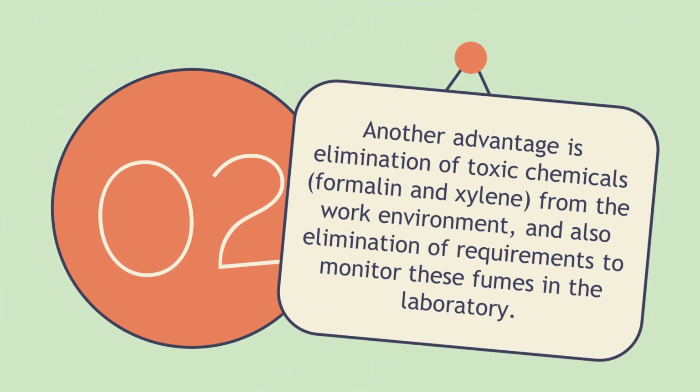Number two, another advantage is the elimination of toxic chemicals. So formalin and xylene have been eliminated from the work environment, and also the requirements to monitor these fumes in the laboratory. Kaya diba, they are very carcinogenic.